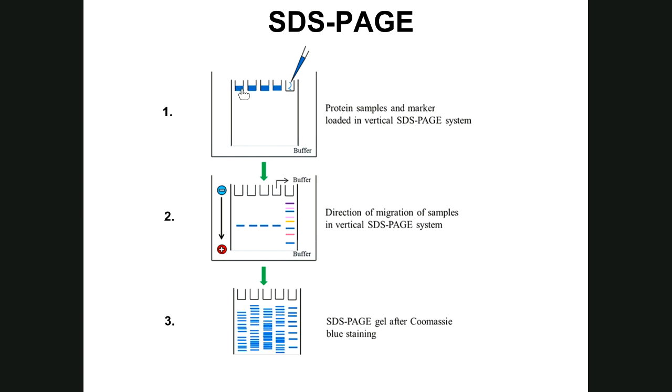Okay, when you analyze your gel where you load your proteins, we refer to these as wells, and we number these wells, such as here, well 1, well 2, well 3, well 4, well 5. However, when you finish the electrophoresis process, the SDS-PAGE technique, and the Coomassie blue staining, we refer to your protein samples, where they migrated straight down from the well they were in, as lanes.